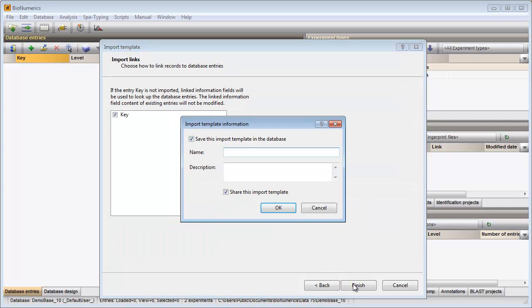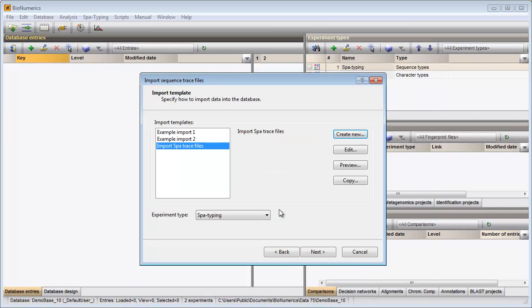In the last step I need to specify a name for my template. My template is now added to the database.